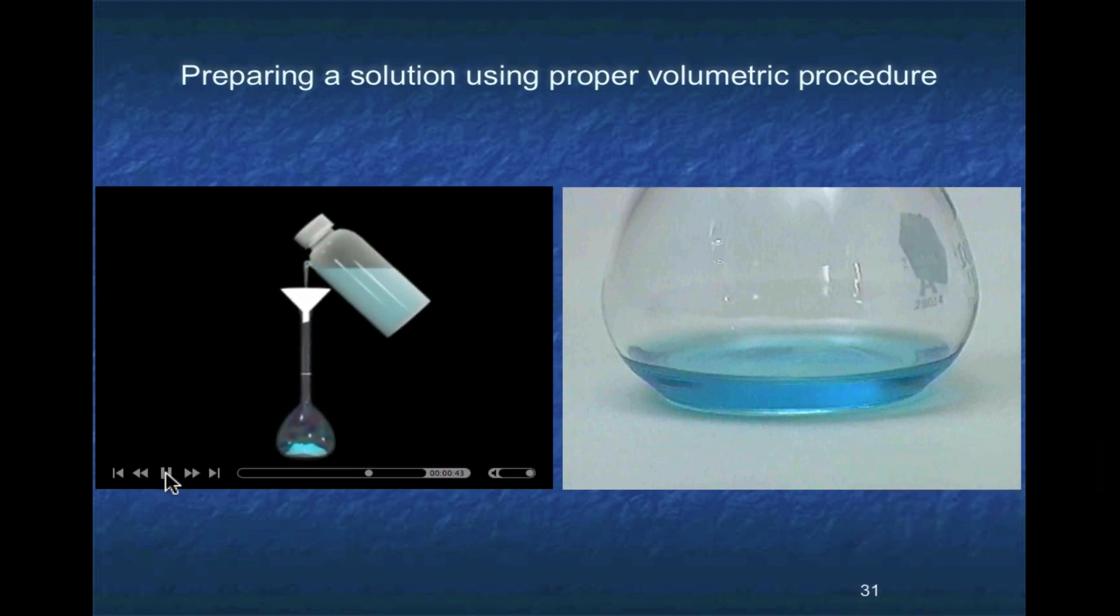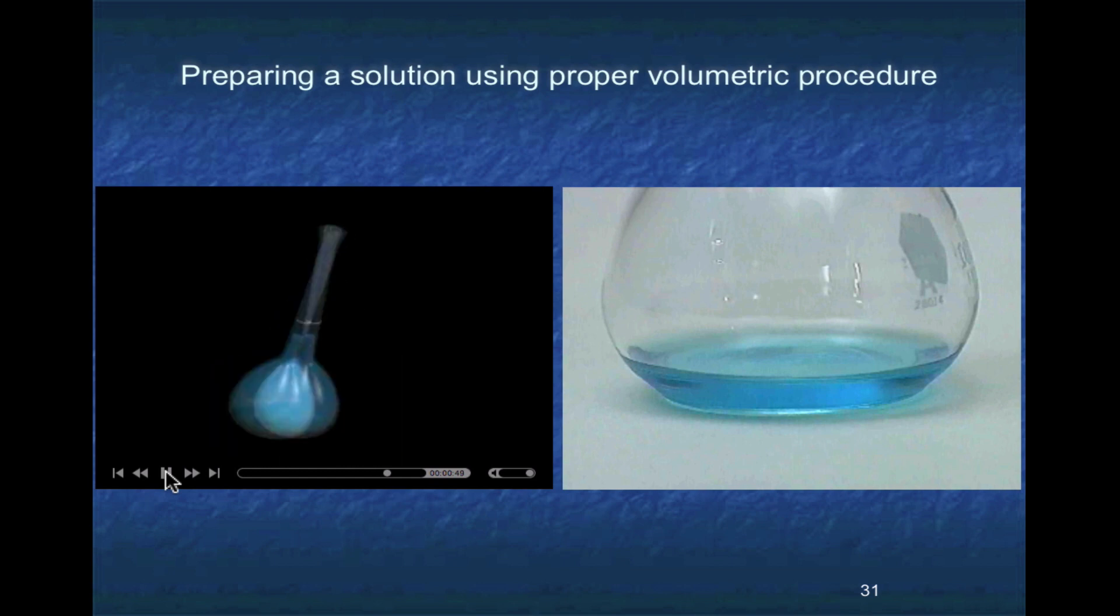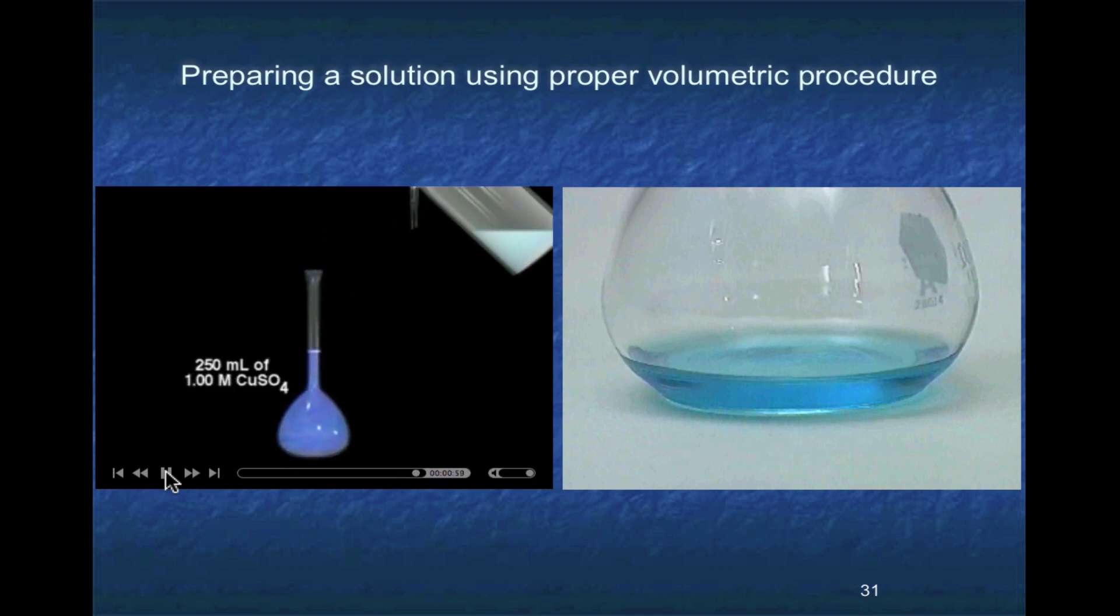Next, transfer the copper sulfate completely to a 250 milliliter volumetric flask. Water is added and the flask swirled to dissolve the solid. Finally, water is added to bring the total volume in the flask to exactly 250 milliliters.